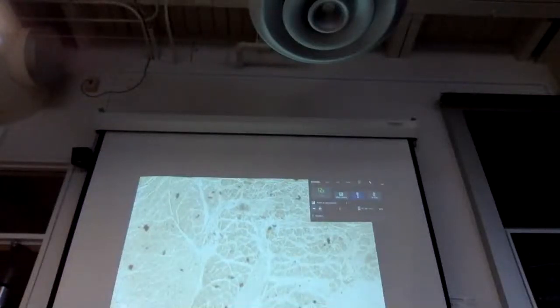Question two. We have another muscle type. You can see that a single cell branches. So here's a branch, here's a branch, like this. See that? What kind of muscle is this? Third type. It's longer or spindly. It has less arrangement of proteins inside. Smooth muscle.